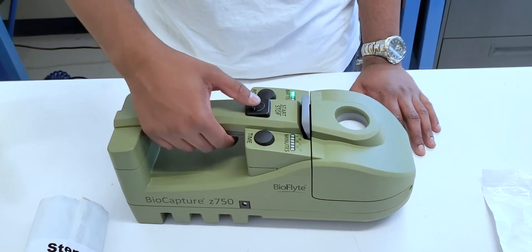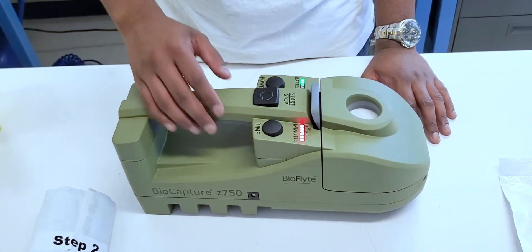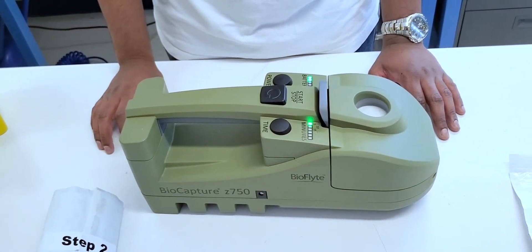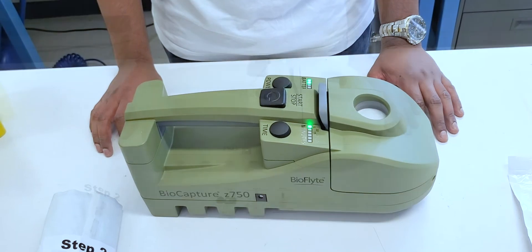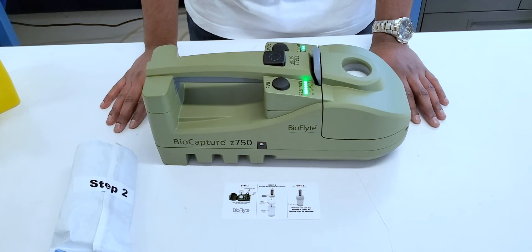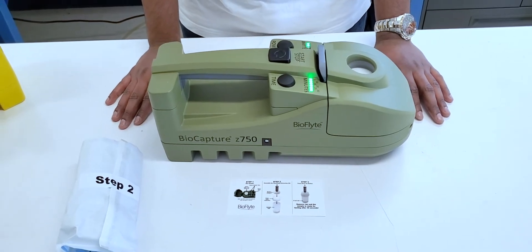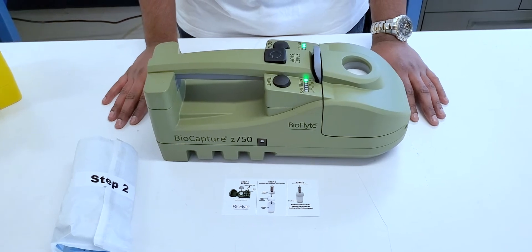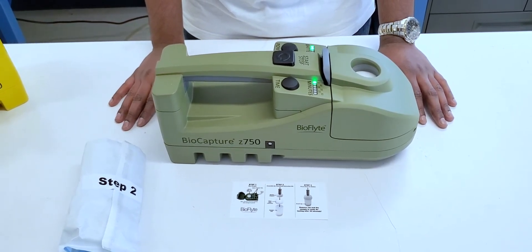You can stop the sample at any time. When you do, you will see that six red LED lights show up, which indicates that the full sample was not achieved. As you can see, we have just completed our five minute sample. The flashing green lights indicate that the sample was done and the device will turn off automatically.